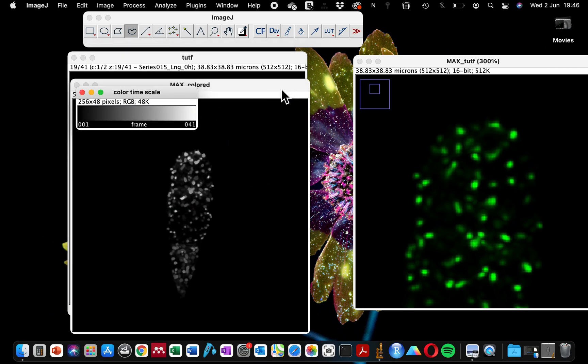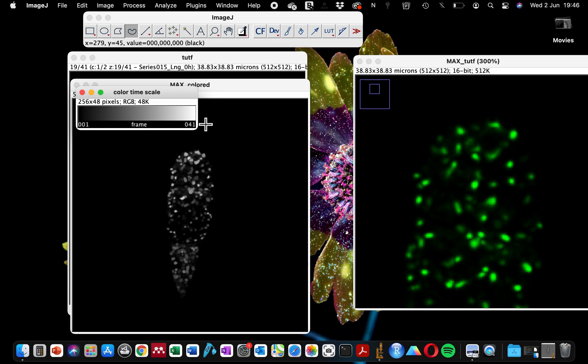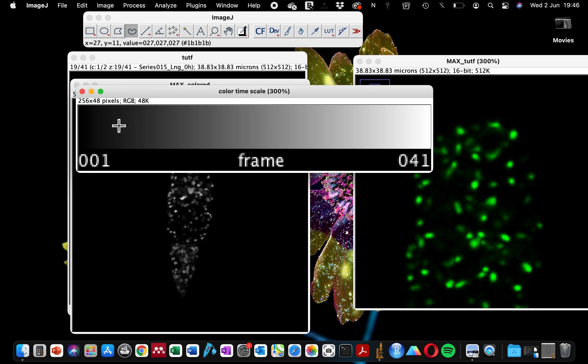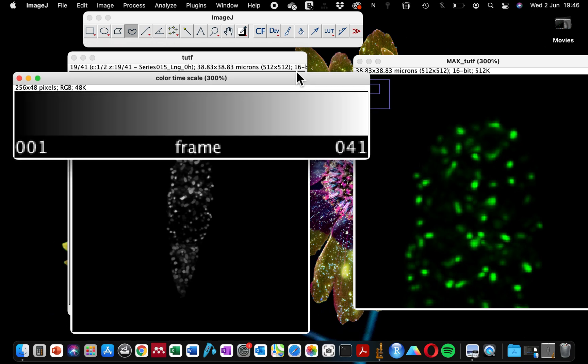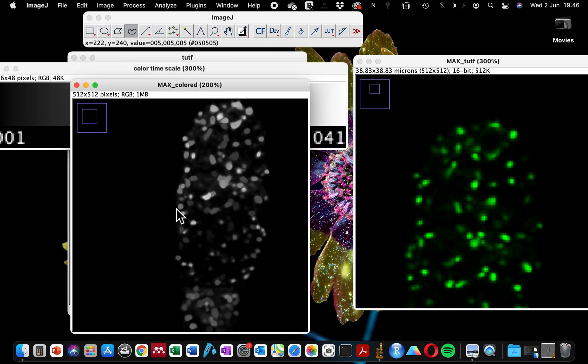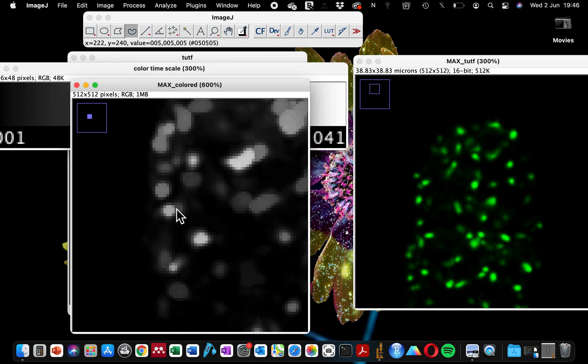You see, when I selected the grays function, the grays color coding, it gave me a scale bar that is from dark to light. If you look at this sample, you can also see that some are brighter.